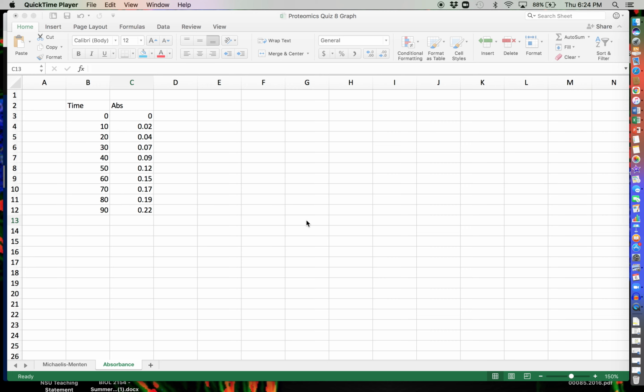So I understand there's been a little bit of difficulty in treating the data that we collected for some of our enzyme kinetics experiments, so I wanted to make this hopefully instructional video that should help you out a little bit with some of the most troublesome issues.